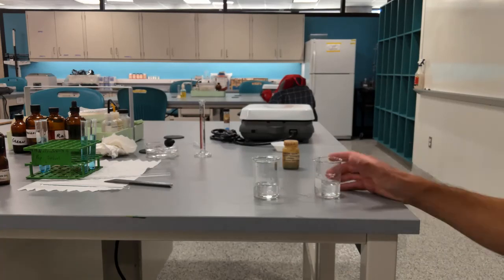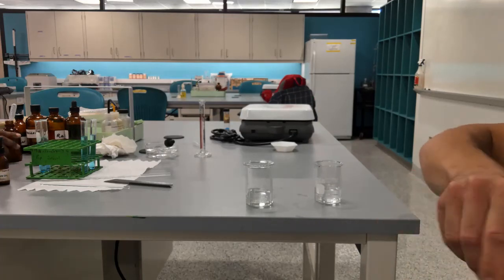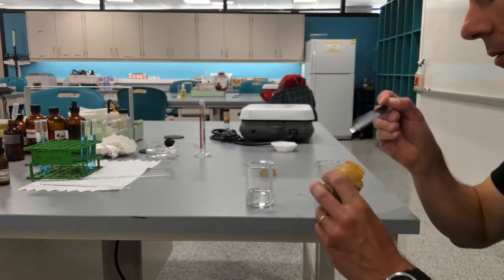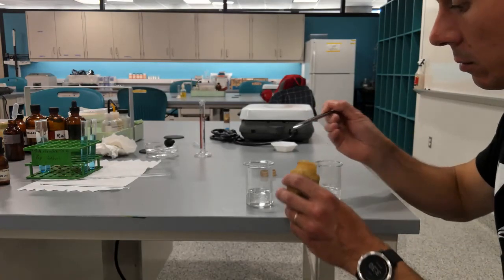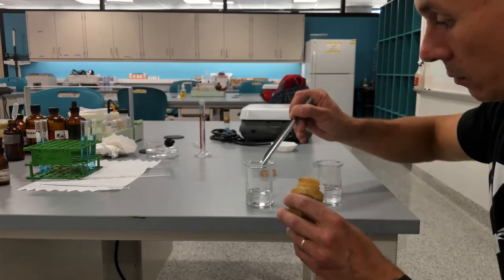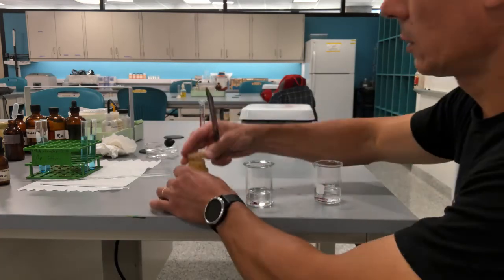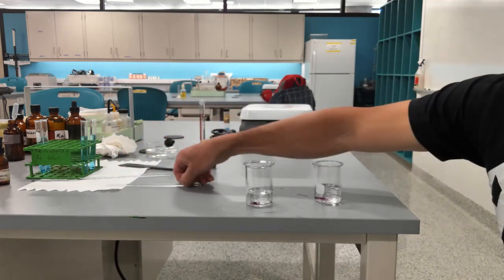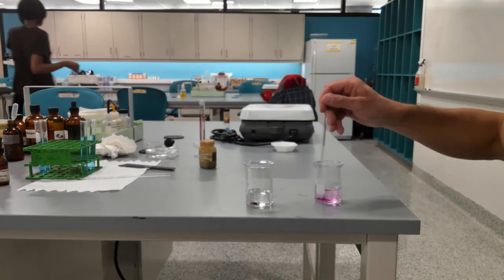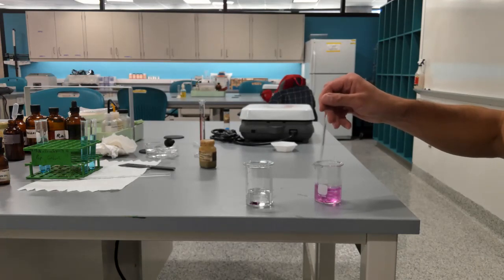So here I've got 2 beakers with water. I've got potassium permanganate. I'm going to add crystals here, a few crystals here, and then you're going to be watching as the color changes. I'm going to agitate this one, and you can see that agitation dramatically increases the rate of diffusion.